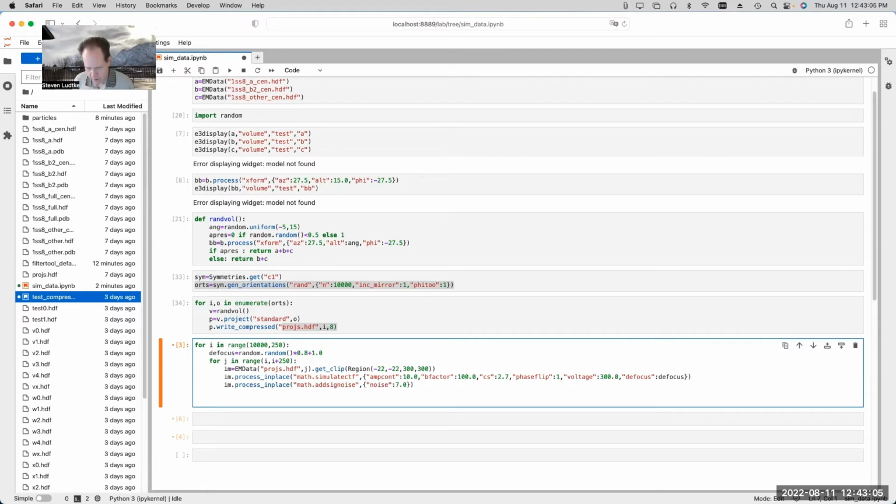Okay, and then once we've got our image processed, we need to write it back to disk. And since last week, we have fixed the write image notation so we can specify the number of bits we want to keep in the final image. It was kind of working funny last week when I said :8 in the file name. It was doing funny things. So I can say write image particles/, right, so I need to use a format string here.